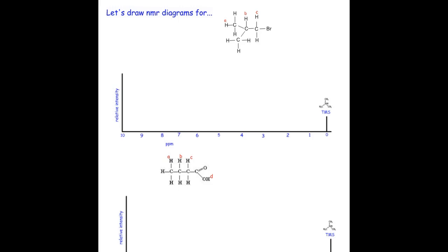For peak A, we said that there are 6 of them, and they will be split into 2, and they will show up somewhere around 0.9. So I'm going to make a pretty tall peak around 0.9. And it's longer than that just because it's a sketch.